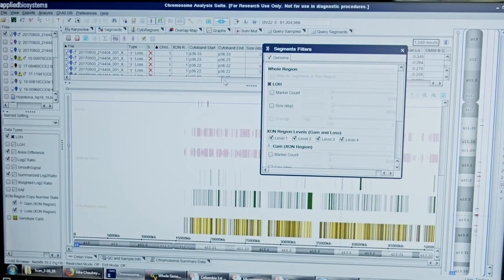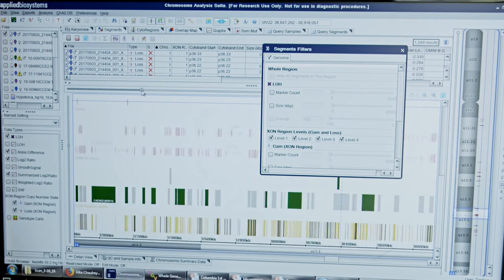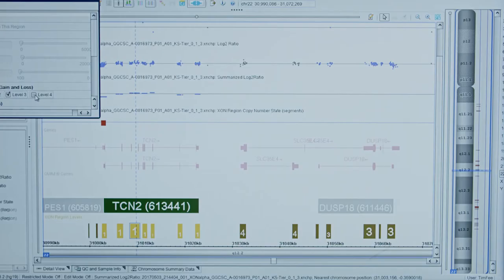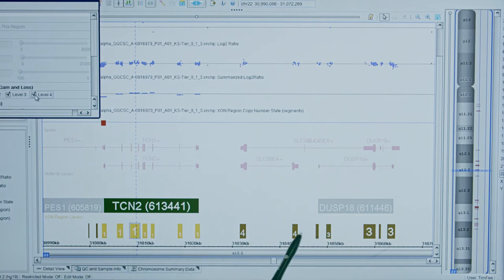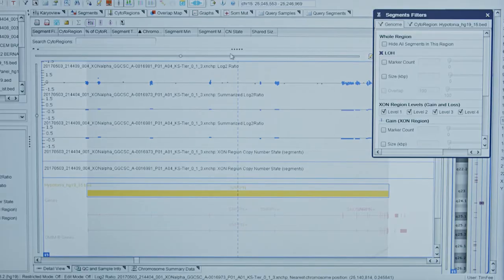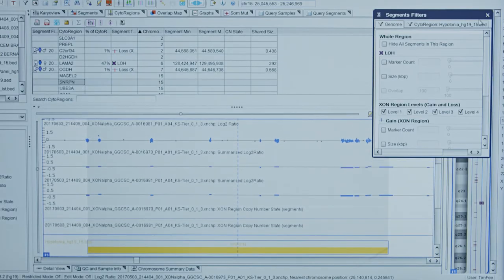The Chromosome Analysis Suite software is extremely flexible and easy to use. It allows me to look at all the genes in four tiers based on relevance. With the click of a button, I can either look at tier 1 or tier 2, or all the genes on the array platform, or even a focused approach to look at a subset of genes. I can also create a BED file on the fly.